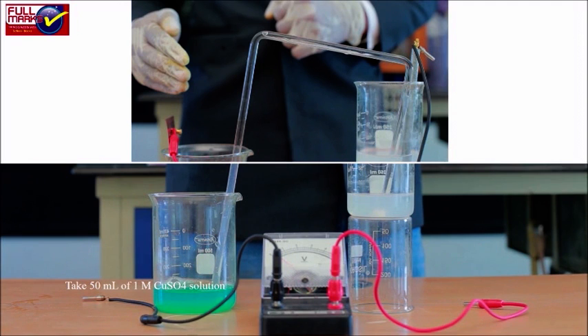Construction of Cell: Clean the electrodes and connecting wires with sandpaper before use. Take 50 ml of 1M ZnSO4 solution in a beaker and dip the zinc strip in it. Connect positive terminal of voltmeter with copper strip and negative terminal with zinc strip.